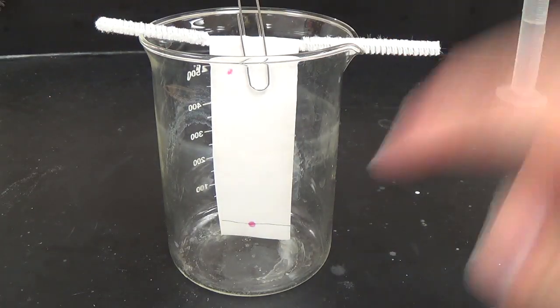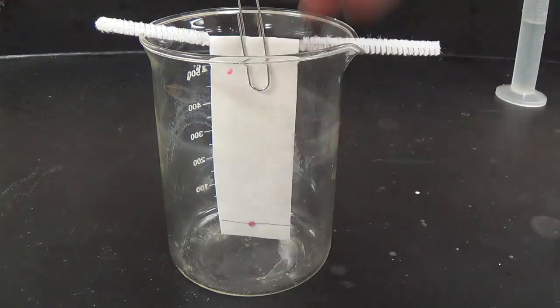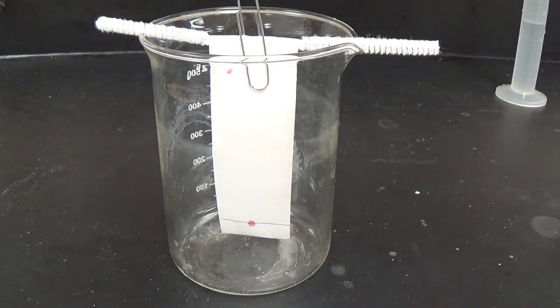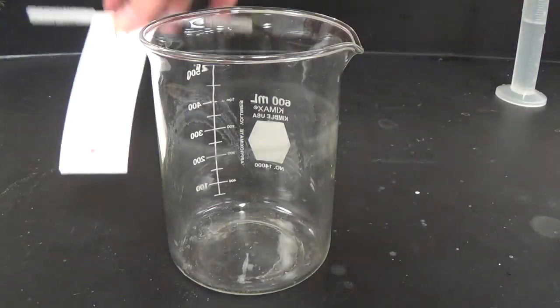So your setup should look like this. And see how it is barely resting above the bottom of the beaker. So either barely touching or resting above. What you don't want to do is just ram the whole thing down into the bottom, because crumpled up at the bottom is going to do you no good at all. Notice the beaker's been dry so far. Okay, I'm going to now take my stationary phase out. This is my stationary phase, the paper.